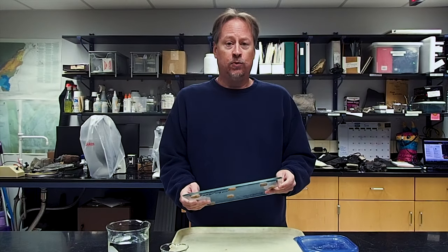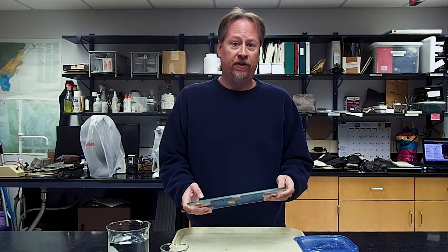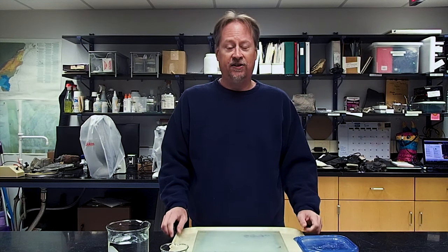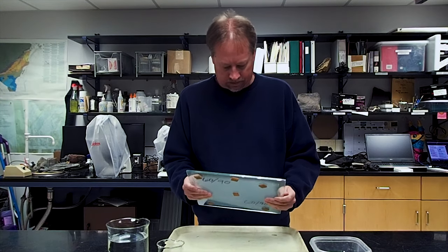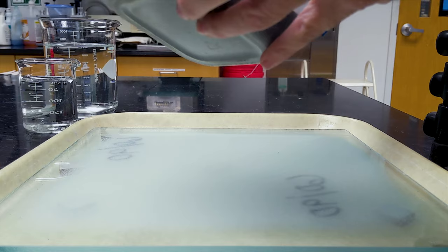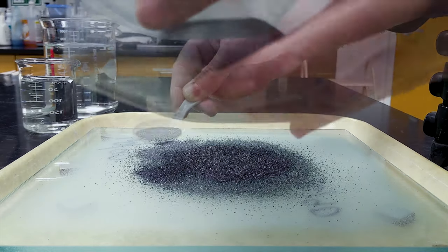Working with powdered grits will inevitably result in some spillage off of the glass plate, so make sure you have a suitable workspace and are prepared for the mess. I like to set my glass plate inside of a cafeteria tray to capture the spillage and to facilitate an easier cleanup. To get started, make sure that the glass plate is clean and free of any grit or debris before using. Make sure you have a stable surface on which to set the glass plate and plenty of space to move your arms around.